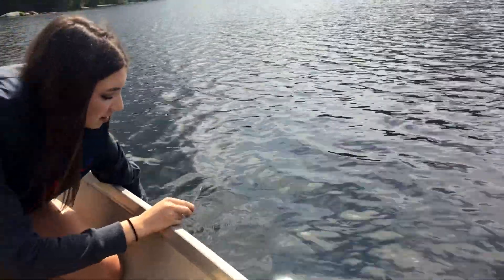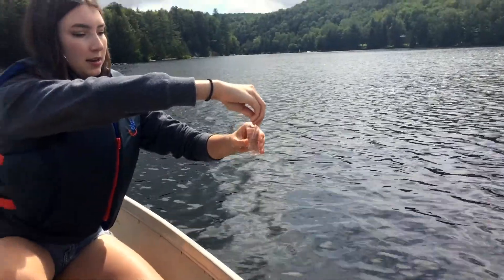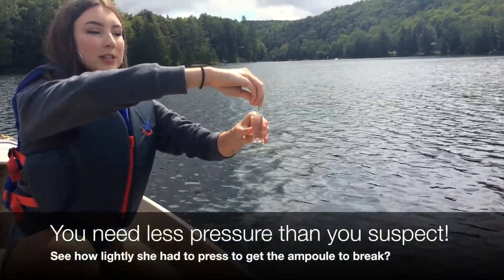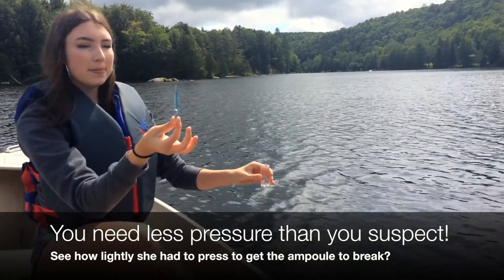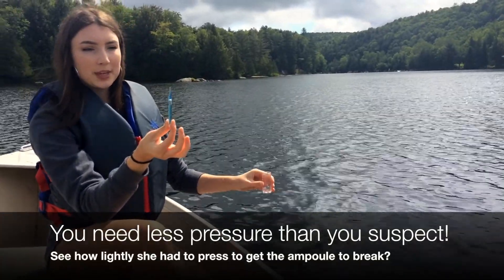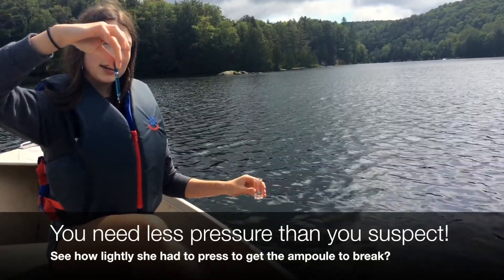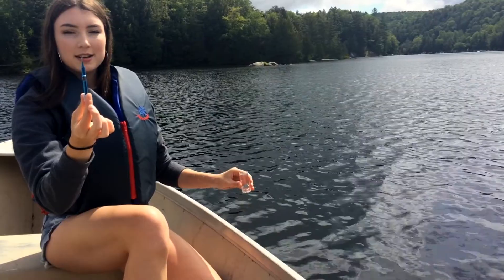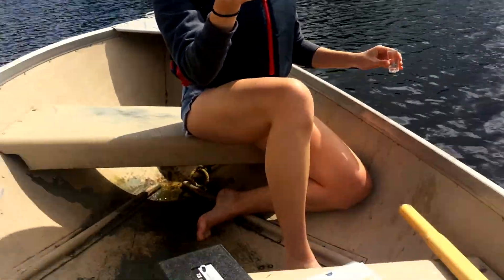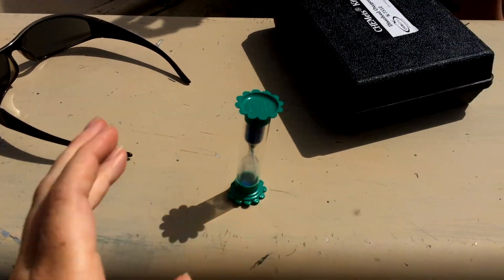I scoop down as far as I can safely reach. Since the ampoule is vacuum sealed, once the glass breaks, water will be pulled up into the sample tube. And now I invert it twice to thoroughly mix everything together, and as soon as the last inversion is done, that is when we start the timer. And now we wait two minutes.